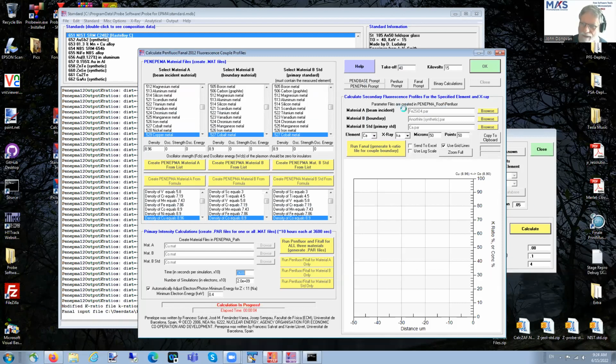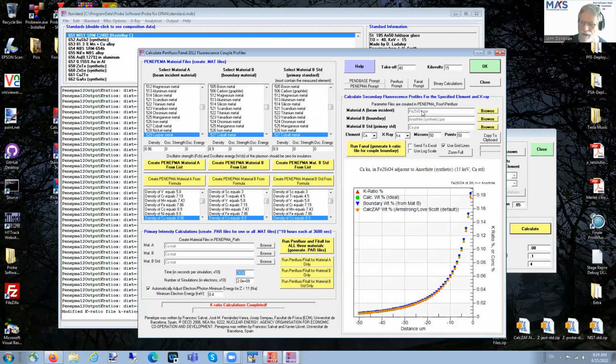So this olivine has no calcium. Now, if your unknown material, the in-beam incident material, did have some calcium, then it would handle that. And so you'd see this not tailing off to zero, you'd see it keep going out. And in fact, you can see that even at 50 microns away, we're getting about 100 ppm of calcium. And we're getting 1,000 ppm at somewhere within 10 microns.